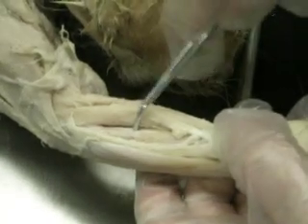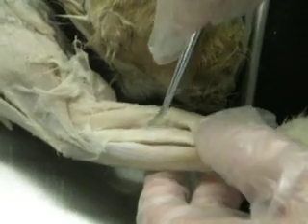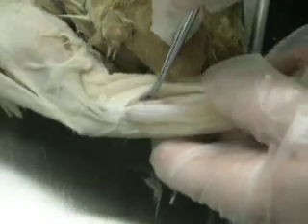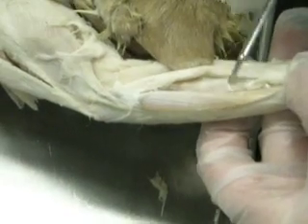This is the supinator, right in the upper part of the radius. If you get a better view of it, the muscle on the lower part is the extensor pollicis brevis.